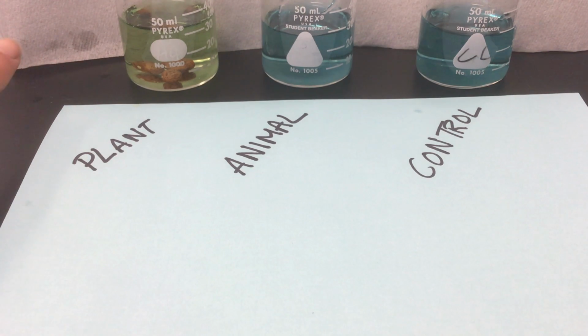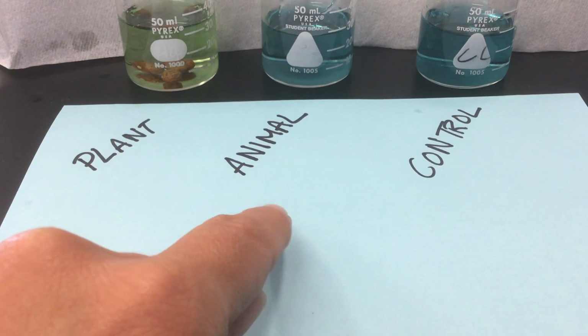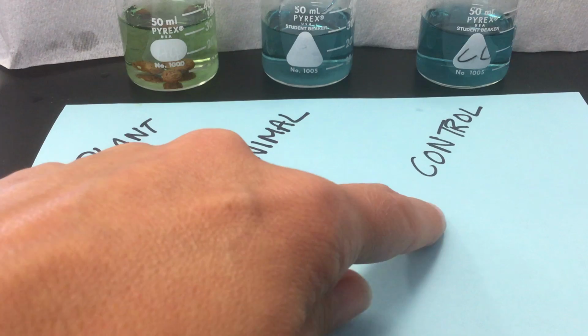So I can see now that the first beaker labeled plant looks yellowish green, definitely a different color than animal, which I have not exhaled into yet, I'm about to do. And then definitely a different color than our control.